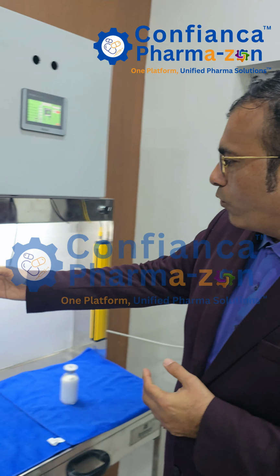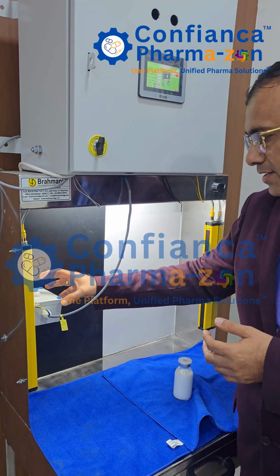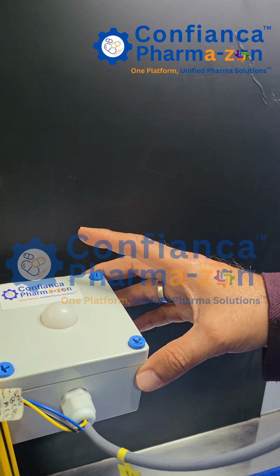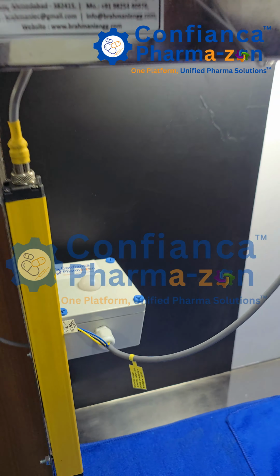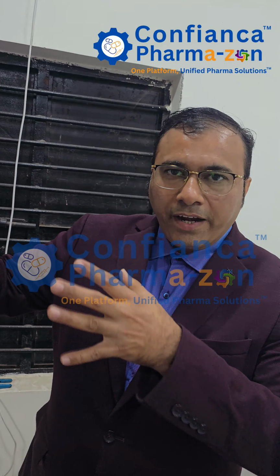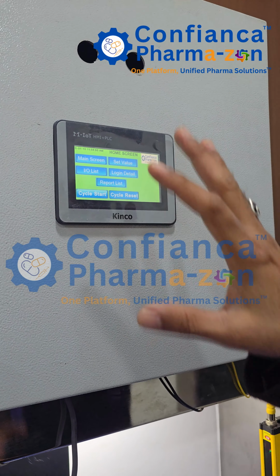Another thing I want you to focus on is our own Confianca-made lux sensor. You can come closer and have a look at this sensor. This is a lux sensor, where you will be able to get the lux value. Now let me show you the entire HMI process. Let's go back to the main screen.